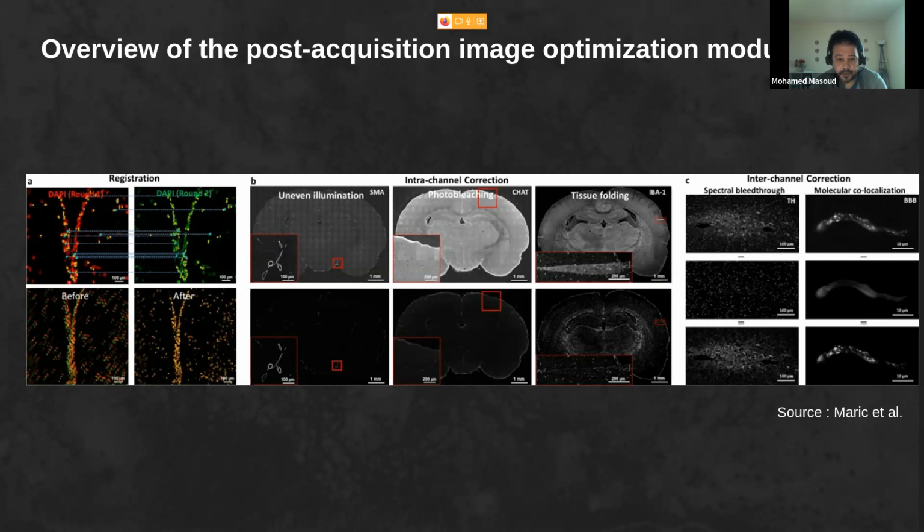There are also multiple sources of noise, like autofluorescence, which is fluorescence that comes naturally from a substance without attaching any antibody to it. There is also tissue folding, and photobleaching, which is a type of fading that happens in the fluorescence signal.